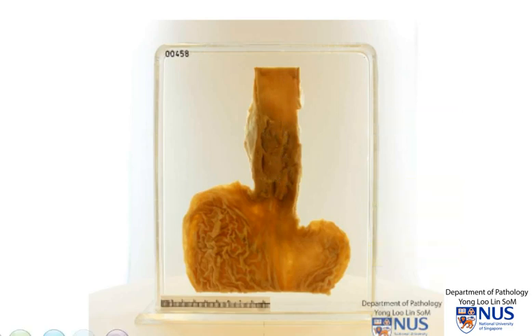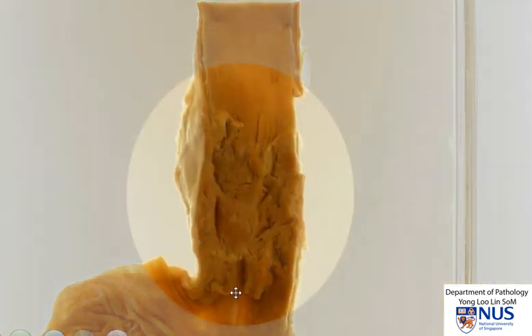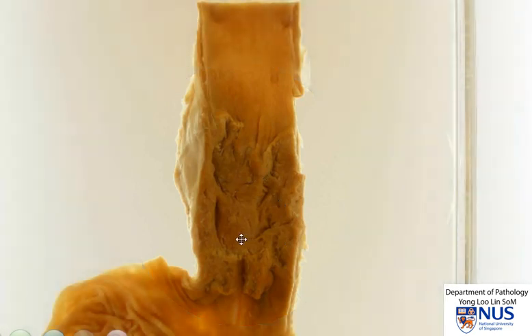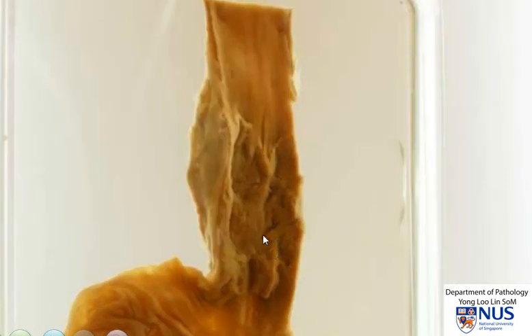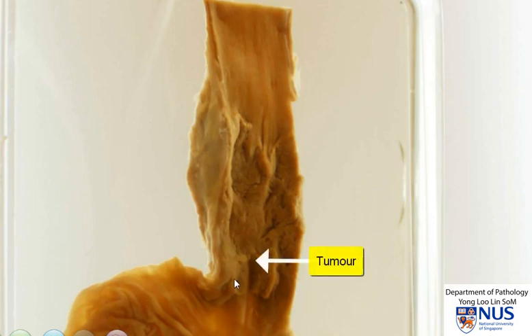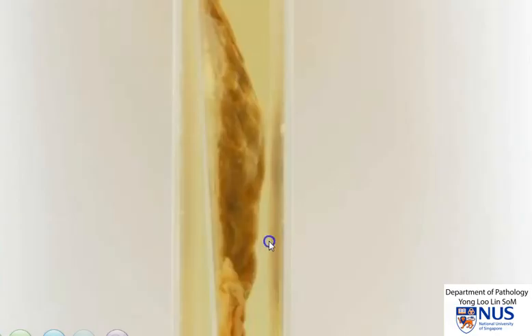As we take a closer look, we can see that the mucosa of the distal esophagus is abnormal. It appears to be irregular rather than smooth. There are some ridges or raised areas, and let me just rotate this slightly so that we can appreciate the irregularity of the mucosa. In some areas, the esophageal wall actually appears to be thickened and we can see a whitish infiltrative tumour here. I'm going to turn it so that we can look at the adventitial surface.